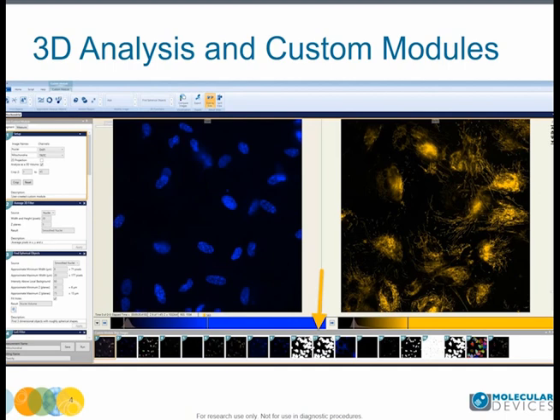And on the last slide, I talked about a third approach to 3D images, where you can basically treat the data as just a bunch of 2D images. To do that, you can turn this option off. Processing images in 3D can take time based on the number of images you have. This section allows you to crop the images in X, Y, and Z, which makes creating the module faster, but still allows you to run the module on the complete image when it's time to do so.